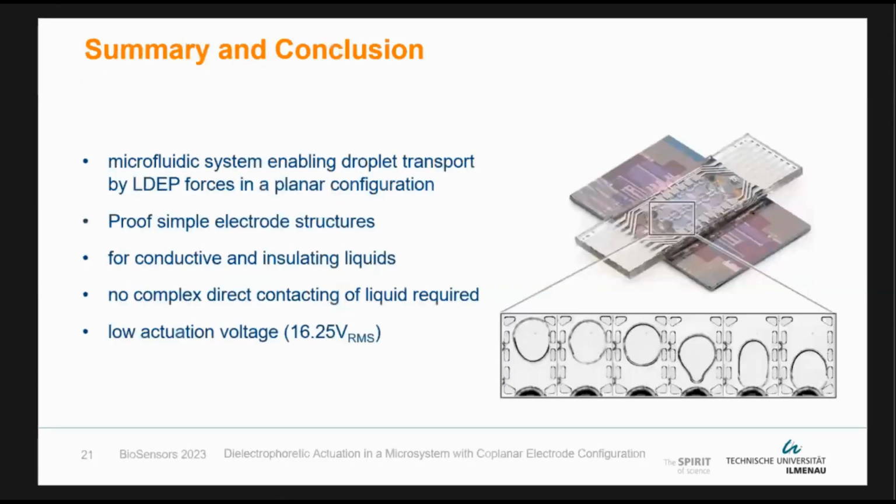So this brings me to the summary and conclusion. Here I designed a microfluidic system that enables droplet transport by dielectrophoretic forces. And this is done for the first time with simple electrode structures. This gives us the opportunity to design simple microfluidic systems to address both conductive and dielectric liquids based on the application that we are going for.